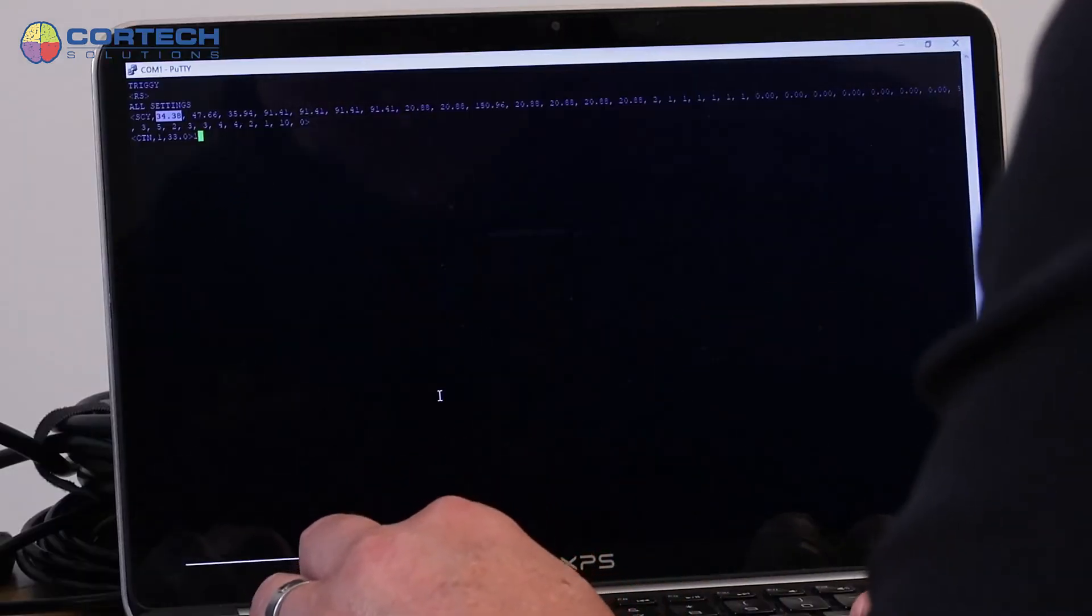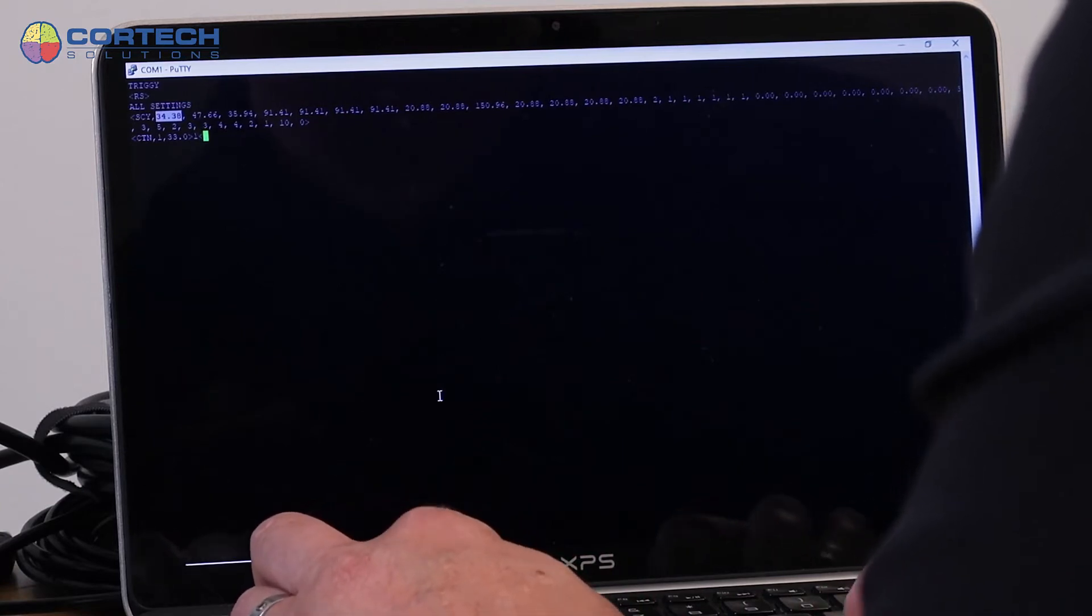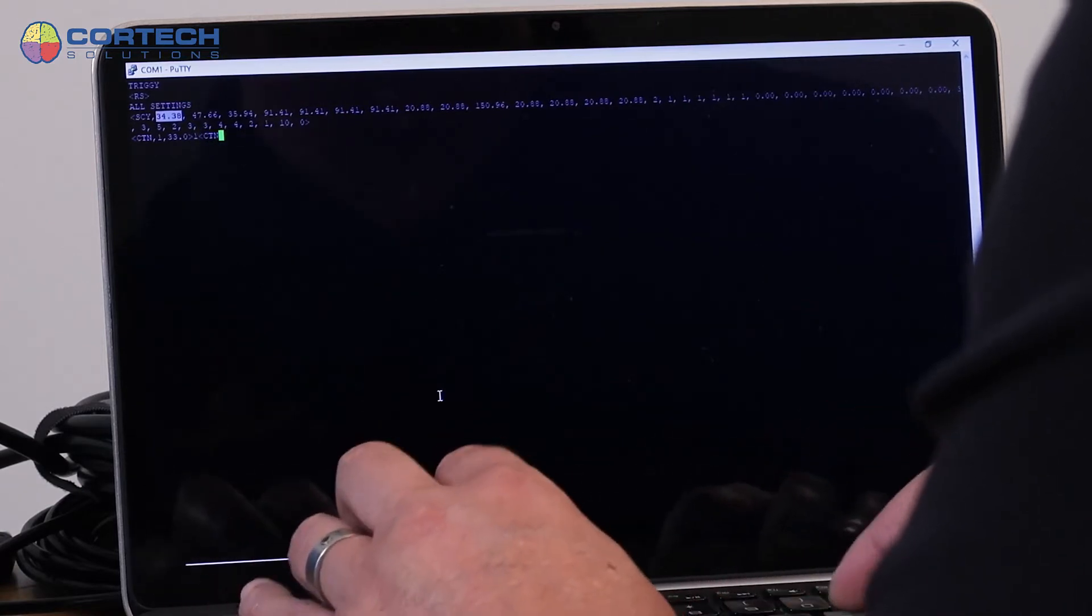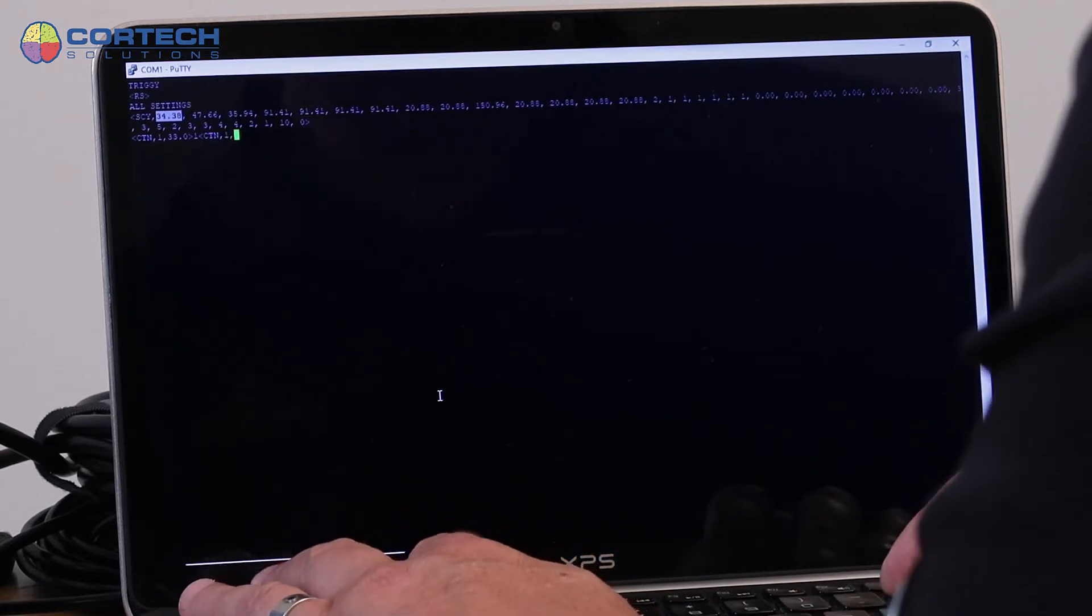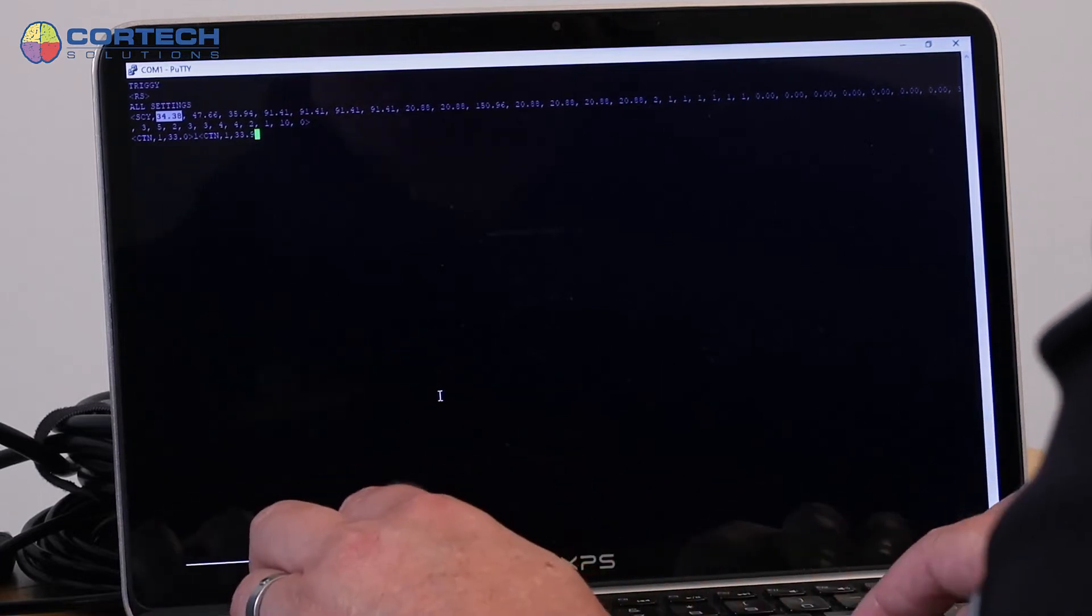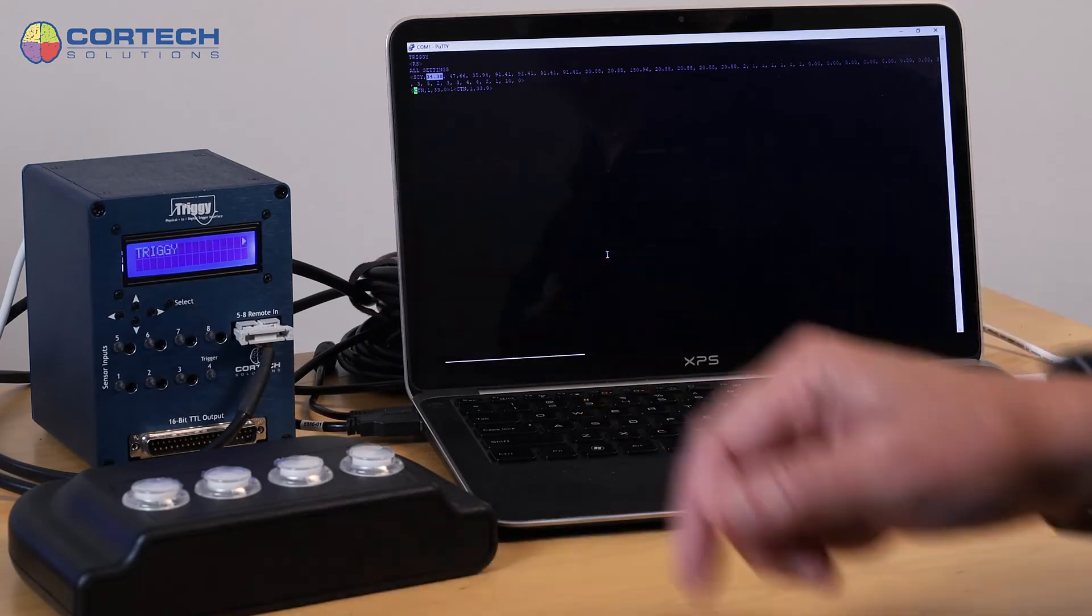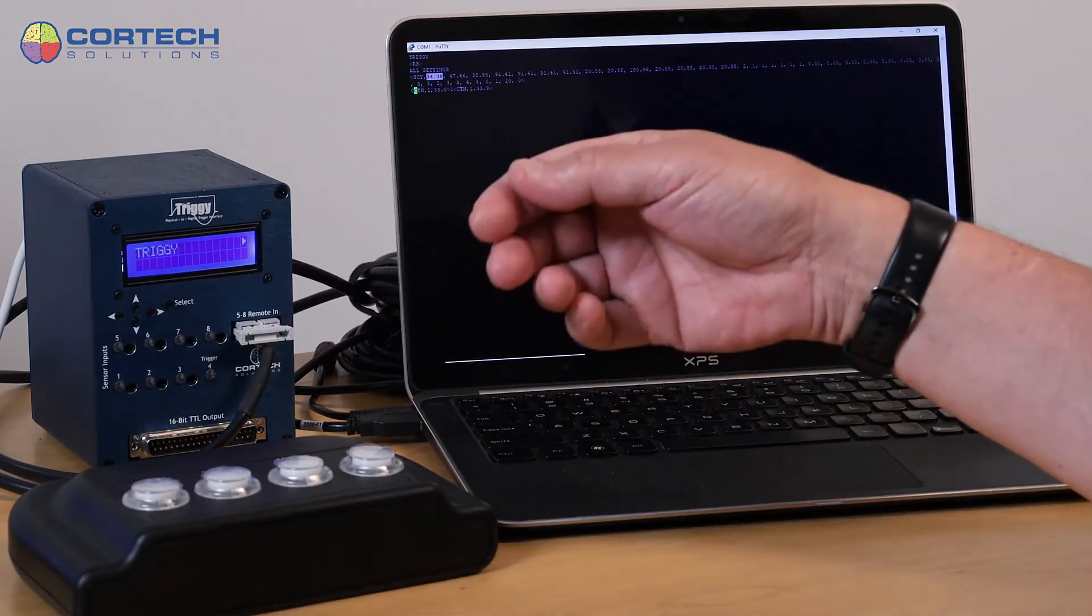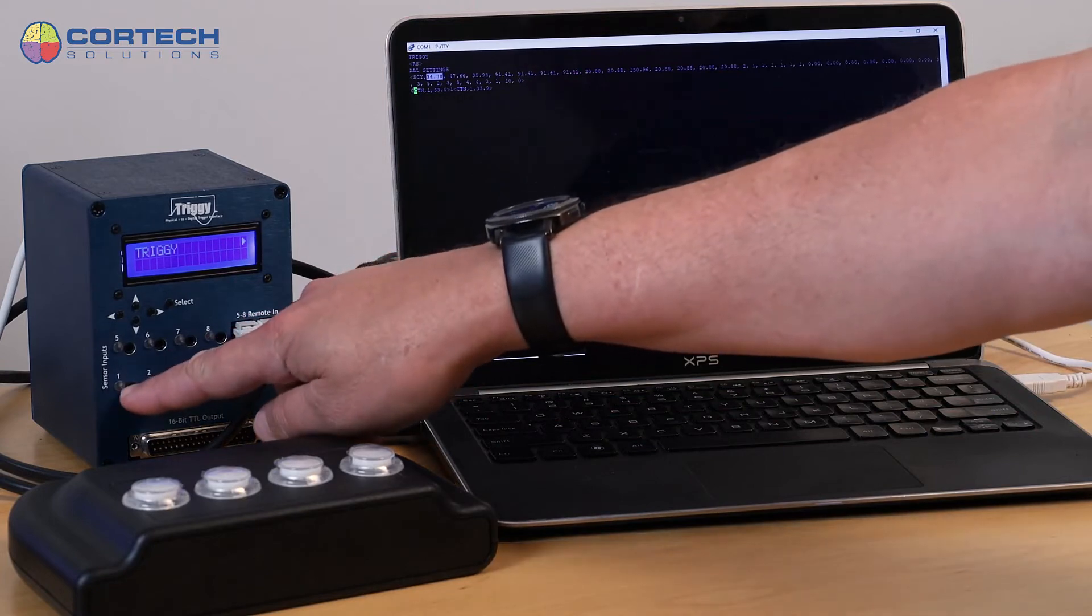And if I want to change that, I want to go back and say CTN channel one 33.9, for example. And now the threshold is set to 34. Effectively, that's the way it's interpreted. And the LED goes off.